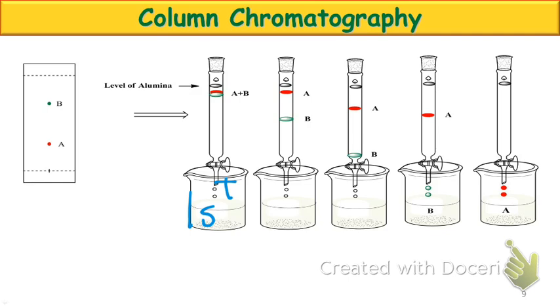So if we add that solid powder to the top of the column, what's going to happen? What are we also incorporating at the same time? It's invisible. Gas, air. We're incorporating air naturally as we do this. So if we now put solvent in the top, what's that solvent going to do to the air? It's going to start to push it and cause it to shift around. Okay, as the air shifts around, what happens to the silica? It's also going to shift around.